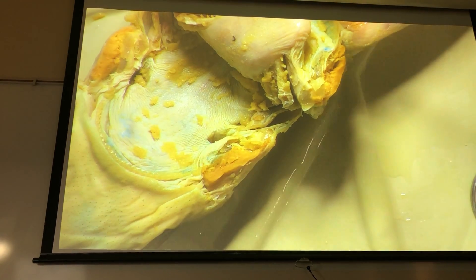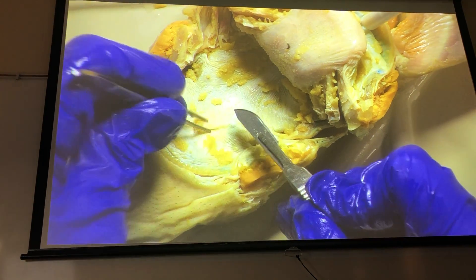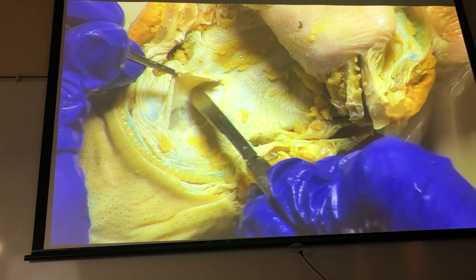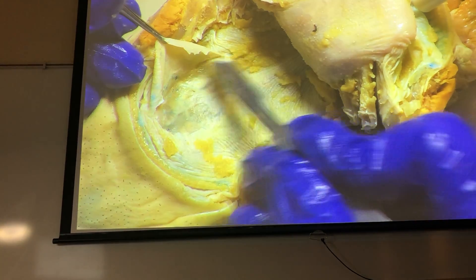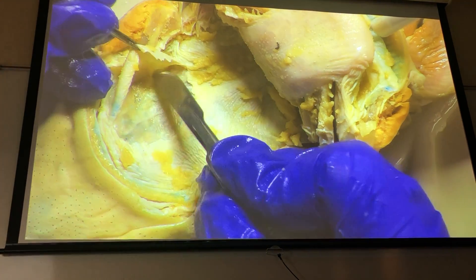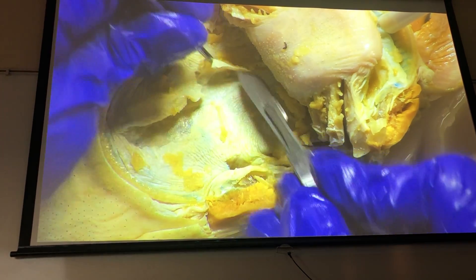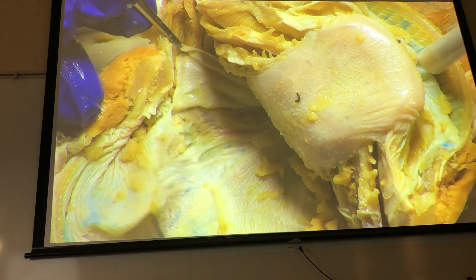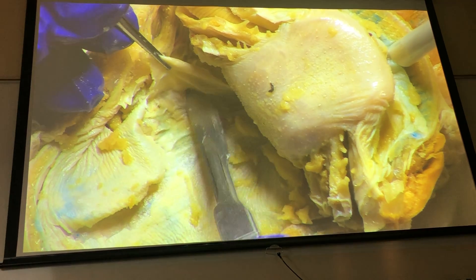The next step is going to involve using your scalpel and forceps to lift up on this white oral mucosa and cut it back. What happens after this is really luck of the draw — it depends on how well injected your animal was. Since this shark's gill membranes are so pale, we're not going to see much here. You're just going to peel this away and look for the underlying pink blood vessels. There are the epibranchials right there, taking oxygenated blood from the gills back to the dorsal aorta.